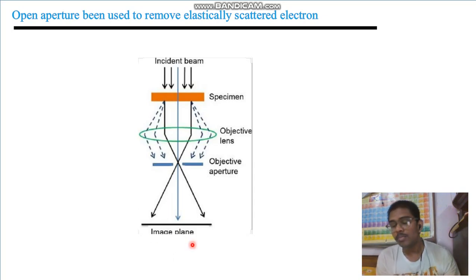The principle relies on the fact that the traditional image forms on the basis of incident electrons being scattered and removed based on the compositional density of the materials as well as the crystal orientation of the sample. In very simple language, if you have very high compositional density, you will get more scattering and a dark spot. Whenever you have very few electrons, you will get a bright spot. That's the basic principle of contrast formation, and contrast formation means image formation in electron microscopy.